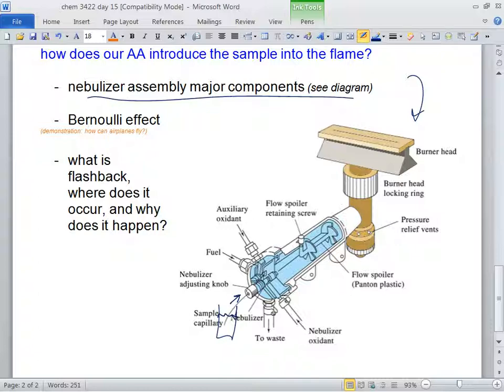Okay, last question is, how does the stuff get drawn into the flame in the first place? It's the Bernoulli effect. It's the same question as how planes fly. How does a plane fly? Anybody know? We're almost out of time. We've got to answer this quick here. What's the shape of a wing? Flat on the bottom and curved on top. There's probably a little more shape to it. They have better shapes. But the point is that here's my wing, and it's going this way.